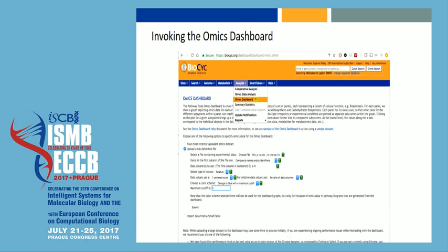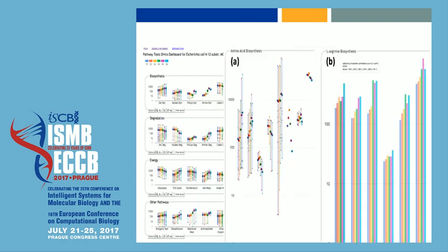To invoke the Omics Dashboard from BioCyc, under the Analysis menu go to Omics Dashboard, where you get a page to load your file and specify various options. I discussed the ability to drill down to see more detail.